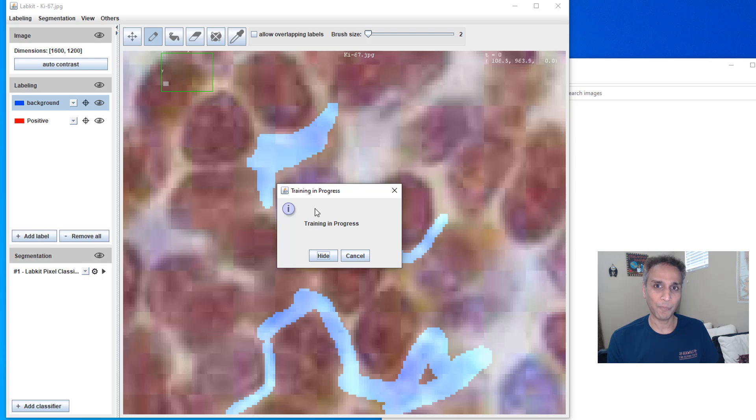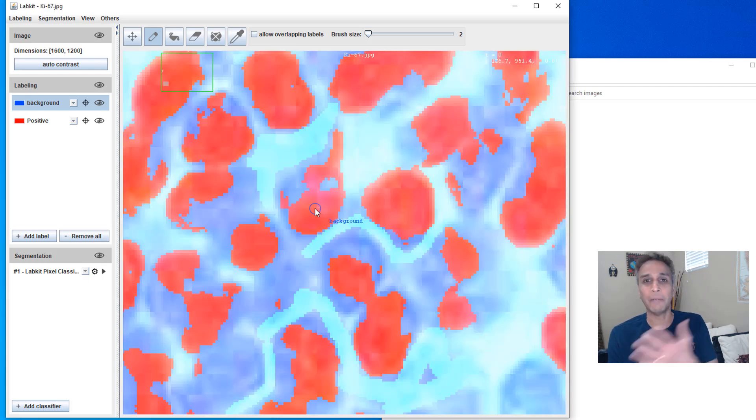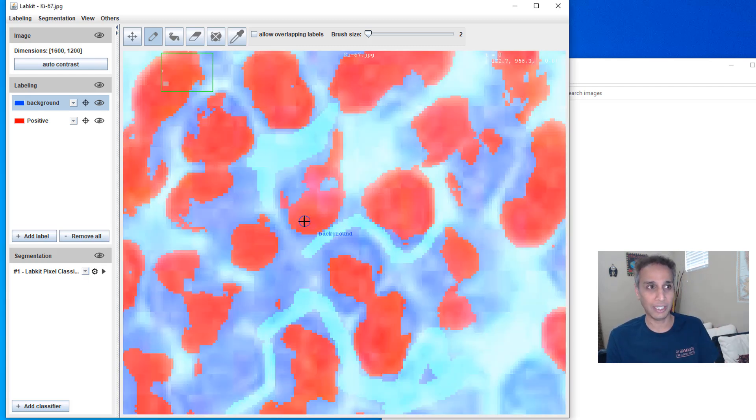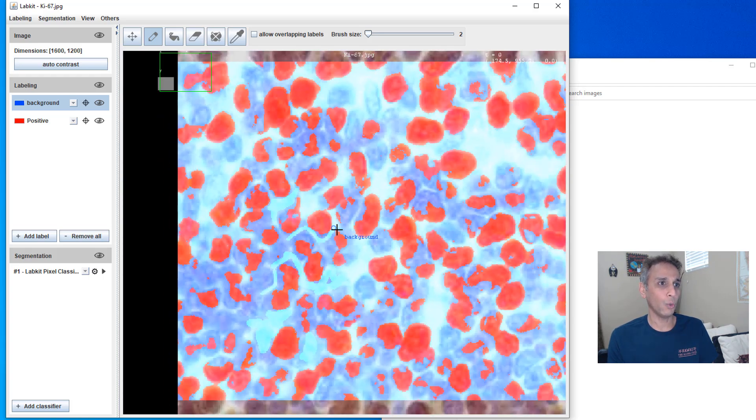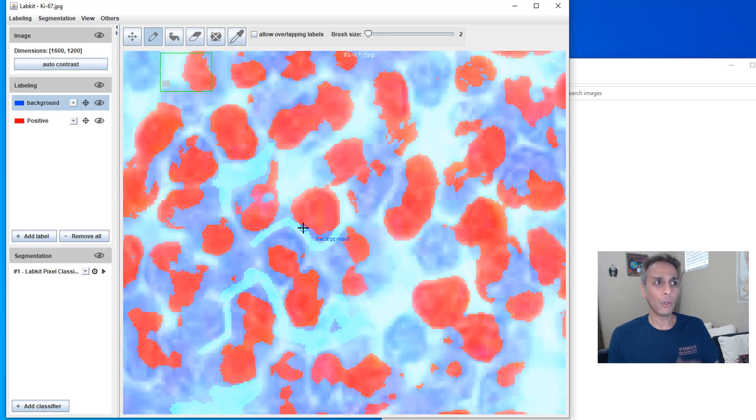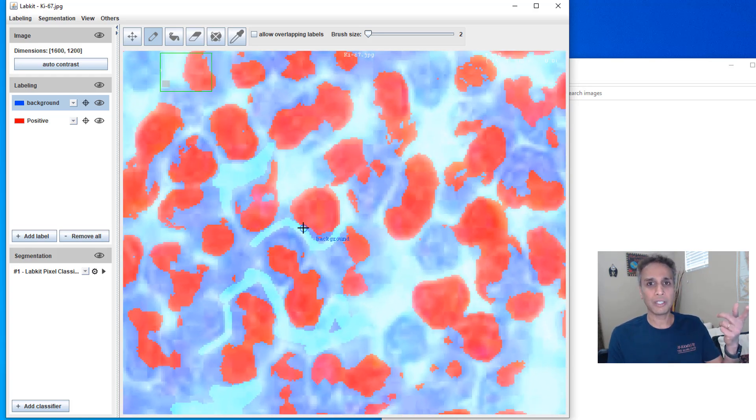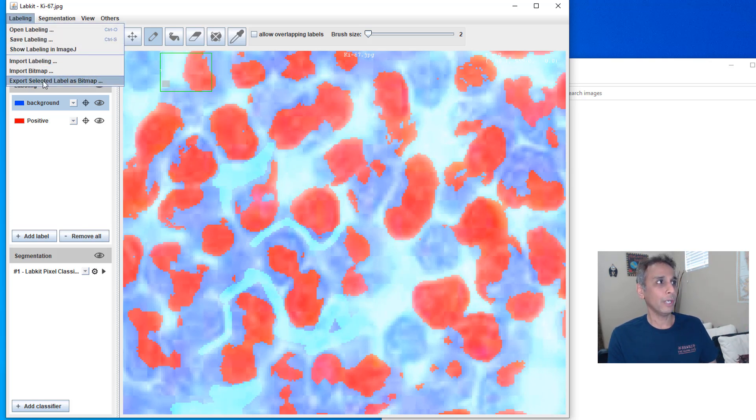Do this two, three times until you are like 95% there and then do the corrections at the end. So now it's doing an over segmentation right here. If you don't like this process, don't do it.